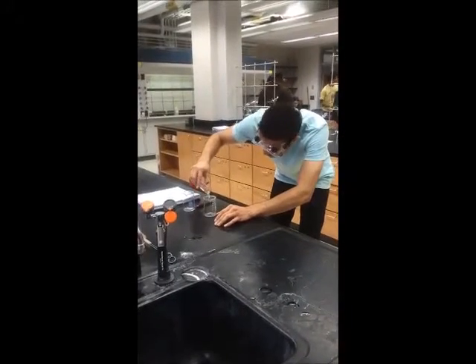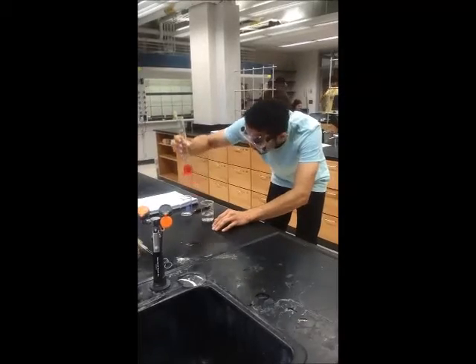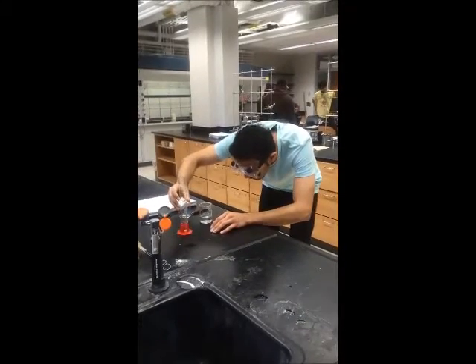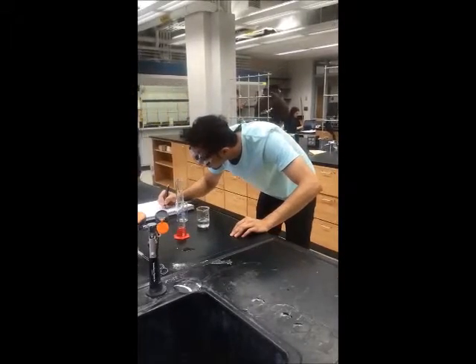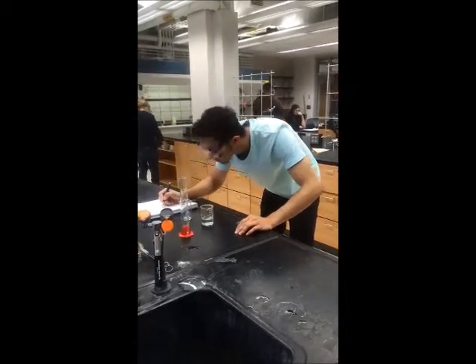Then pour some of your solution from the graduated cylinder to the new beaker. Then read and record. This will be your final volume. After you have the data from the initial and final, do your calculations.